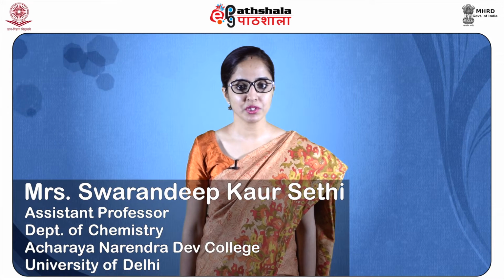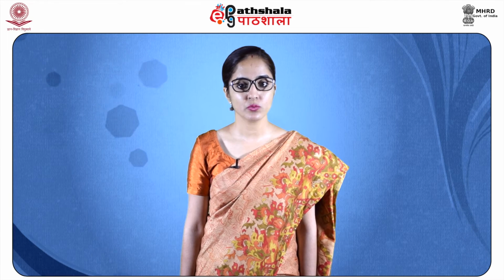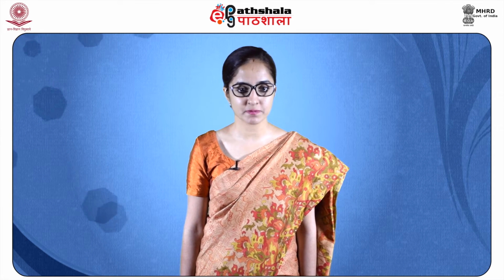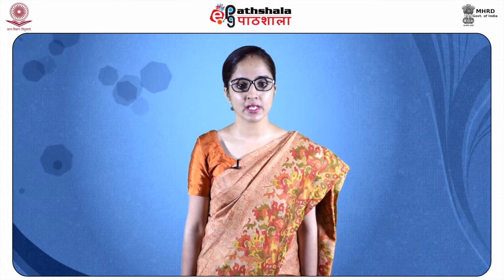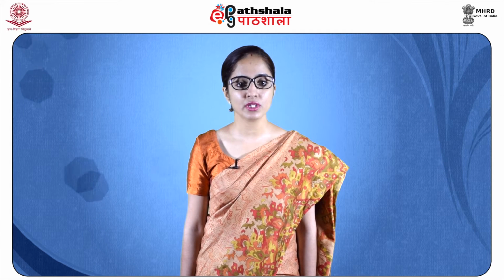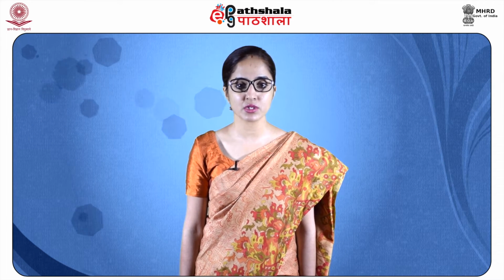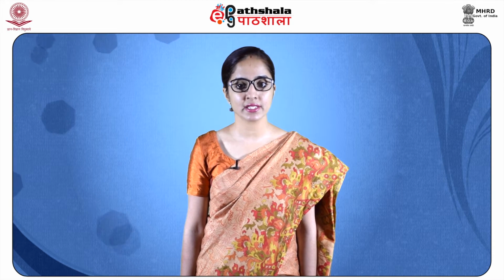After studying this module, you shall be able to understand the points which can simplify complex spectra, understand double irradiation and the nuclear Overhauser effect, understand how the use of lanthanide shift reagents and chiral resolving agents affects the appearance of an NMR spectrum, and also understand the effect of temperature on the NMR spectrum of cyclohexanes.